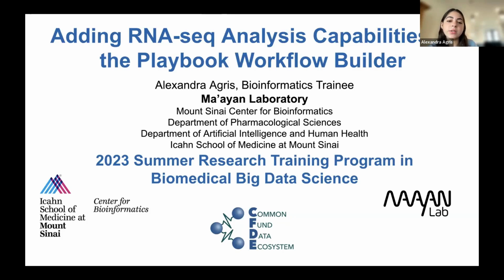Today, I'd like to talk to you about the project I've worked on this summer, adding RNA-seq analysis capabilities to the Playbook workflow builder.